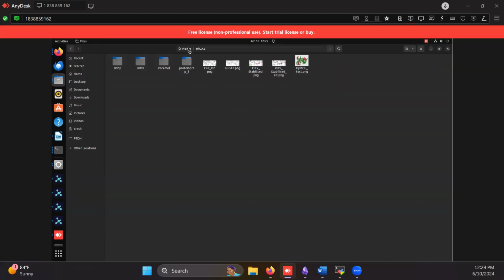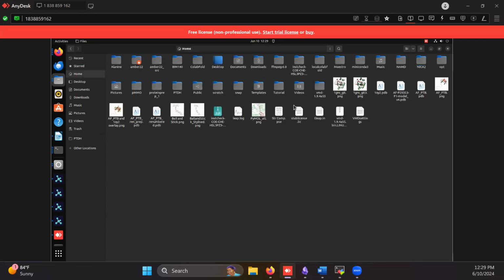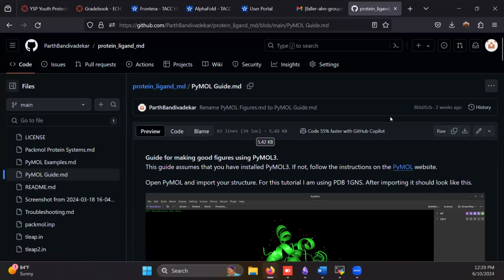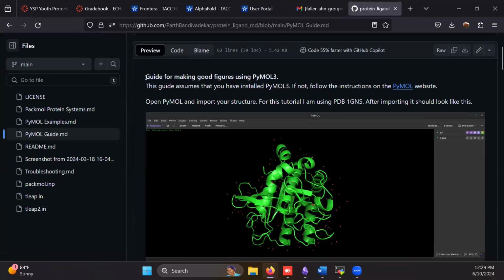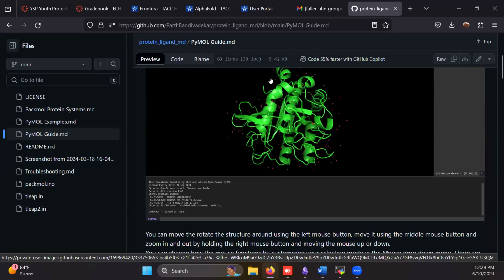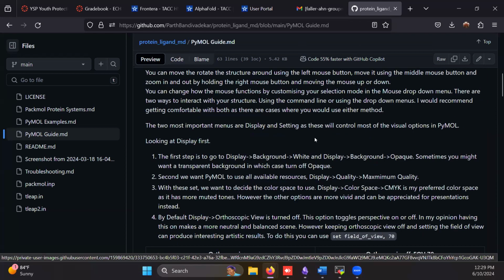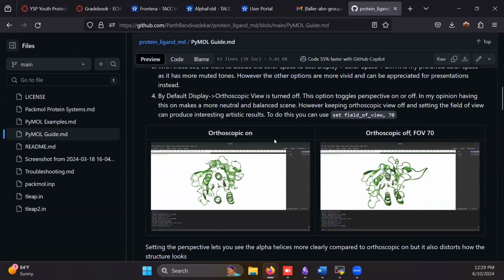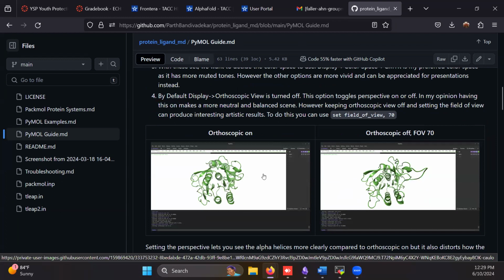Now, I know this was a lot of information. There's a lot more you can do. I was going to show a perspective. Oh, I think it's here. So all of this information, I'm making a GitHub repository for this, so that it's easier for anyone who is coming in, or anyone who wants to have access to this information. I'll link this. I guess I'll share this with Shirley as well. This is not a complete guide yet. I'm still adding a lot of things to it, but it's a good place to start if after today's presentation you want to go and make some images.